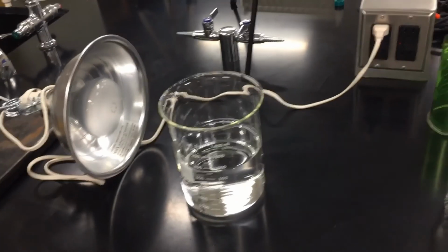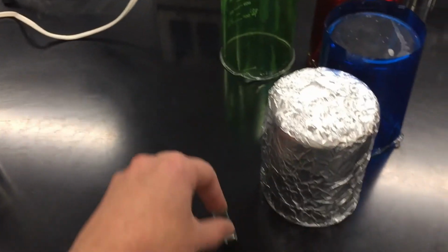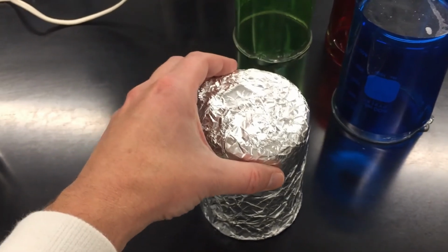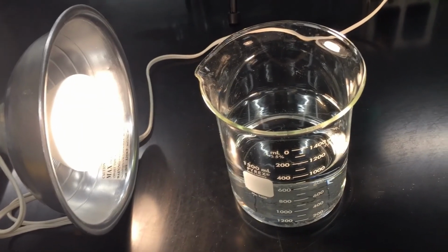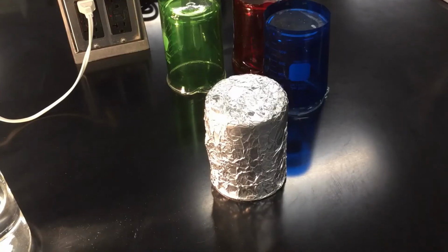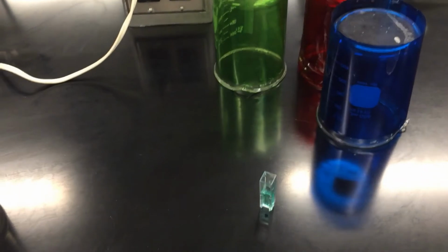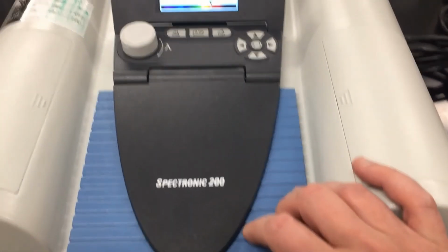So the next thing I'm going to do is take it over to my apparatus. Of course, because this time I'm using the dark control, I'm going to select the beaker with the foil over it. So put that over top of my cuvette. Then I'm going to turn the light on, and I'm going to leave that on for 3 minutes. At the end of 3 minutes, I'm going to turn the light off. I'm going to grab the cuvette, and I'm going to take the measurement in the spectrophotometer.